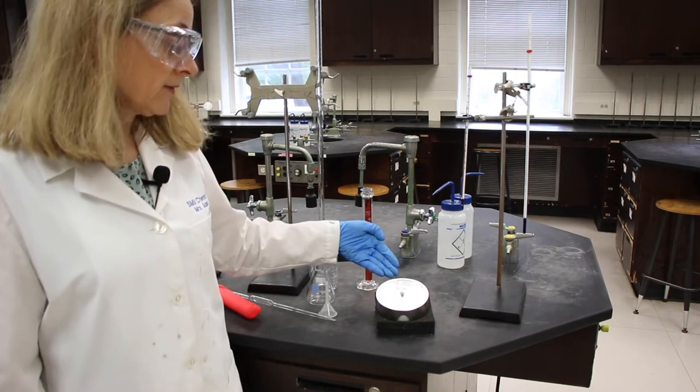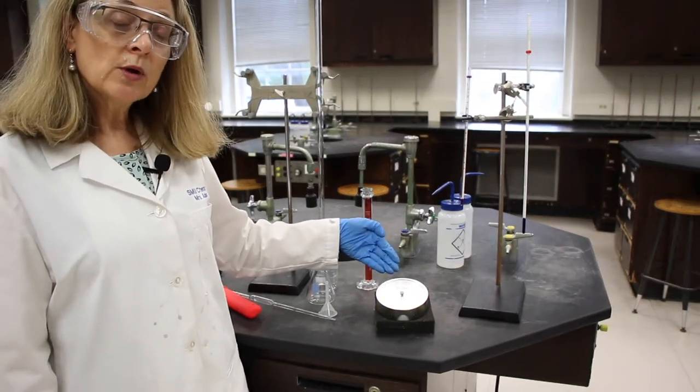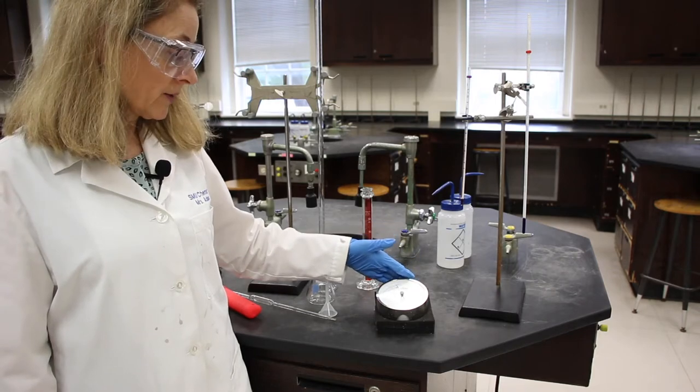So the reading from this barometer is 755.6 millimeters of mercury. That will have four significant figures in this value.